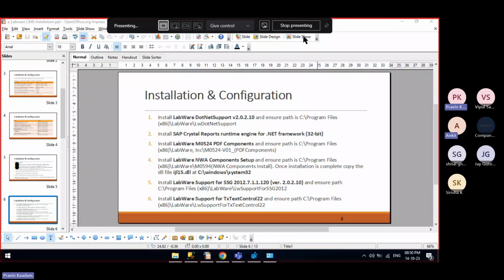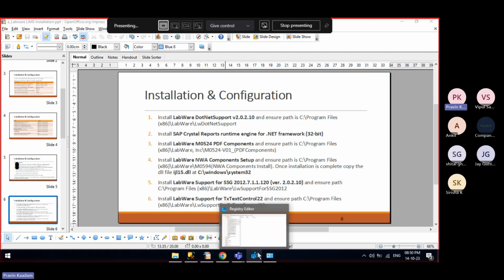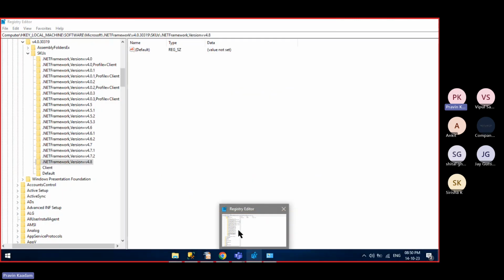Very good question. Yeah. So the SQL Server file that you were talking about to be restored basically contains the table structure of all the tables that are present in the lab. It will not just contain the table structure, but it will also contain some default information which is required for the application to run.